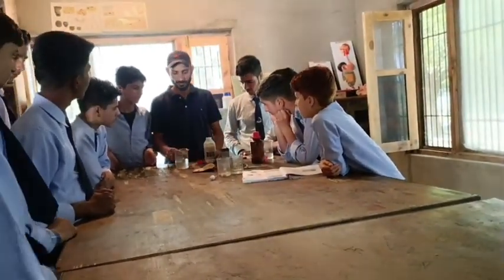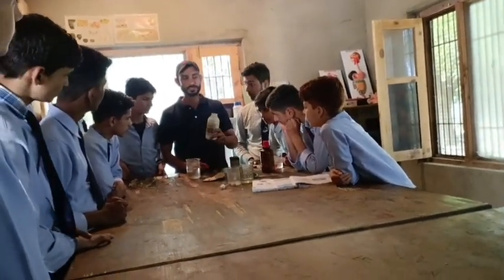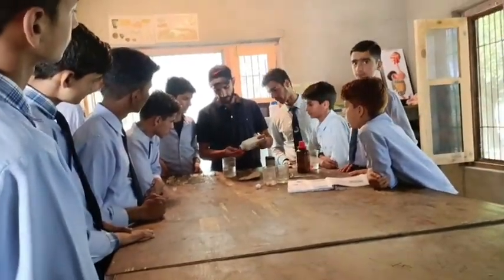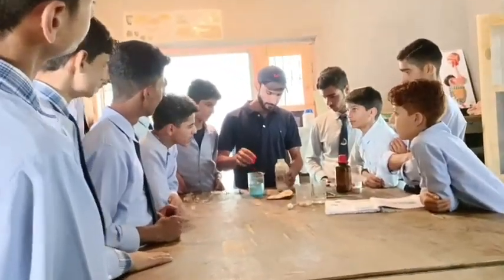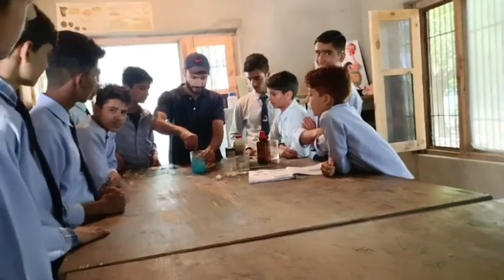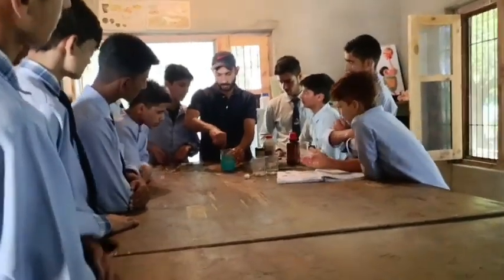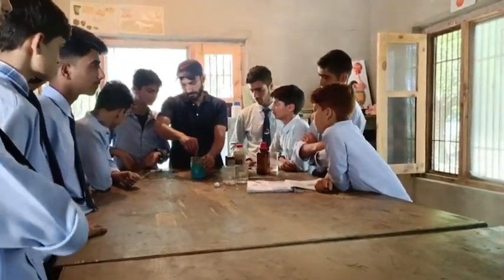First we need water, and in the water we have to use copper salt. I will add some teaspoons of copper salt into the water and mix it to make sure that all the copper sulfate is completely dissolved in the water.